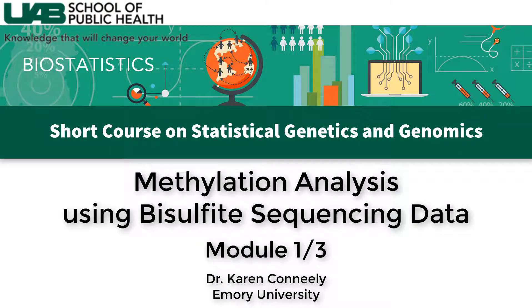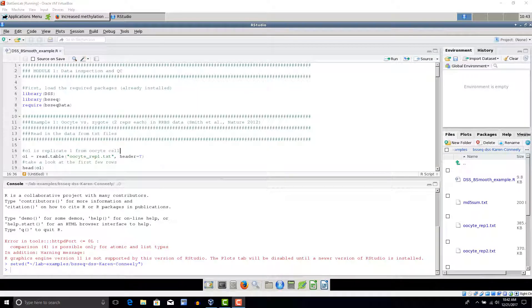Today we're going to try some code for analysis of bisulfite sequencing data. In the first module, we'll read in some already aligned reduced representation bisulfite sequencing, or RRBS, data, inspect it, and perform some basic quality control. In the second module, we'll try several approaches to identify loci and regions differentially methylated between mouse oocytes and zygotes. In the third module, we'll read in whole genome bisulfite sequencing data and use BSsmooth and the DML test and DMR finder functions from the DSS package to identify differentially methylated regions in colon cancer.